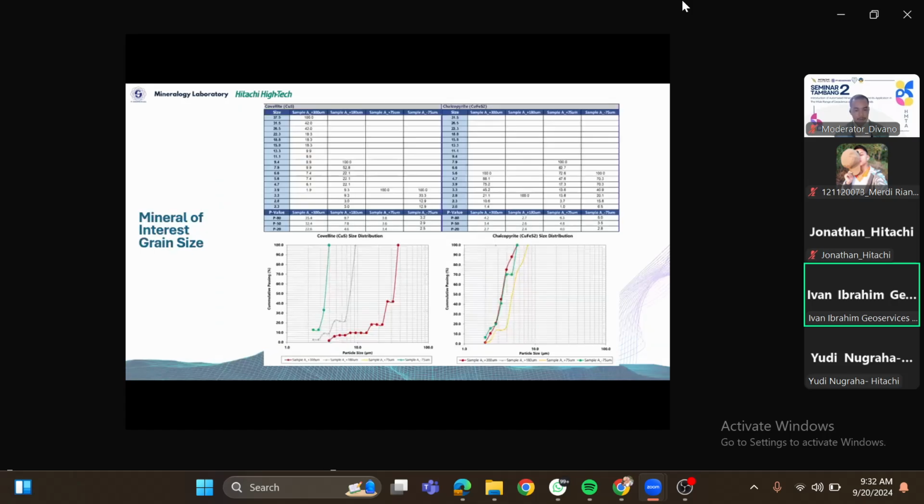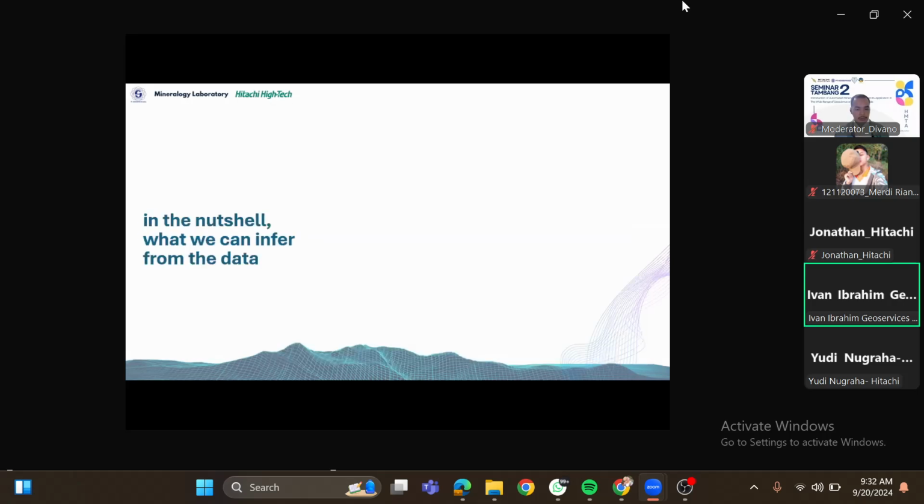Nah, ini ukuran butir dari masing-masing mineral. Ternyata covellite sendiri di sampel pertama itu ukurannya bisa sampai 37,5 mikron. Lalu ada chalcopyrite yang variasinya masih semuanya di bawah 10 mikron. Kita bisa mengetahui ini dari automated system. Gitu. Jadi datasetnya memang banyak. Oke, lanjut.